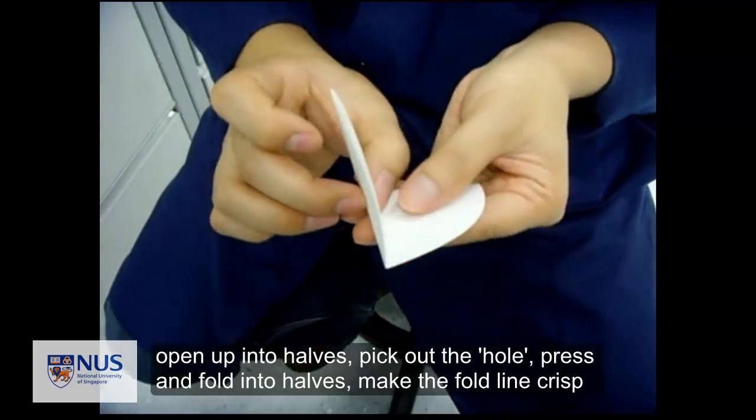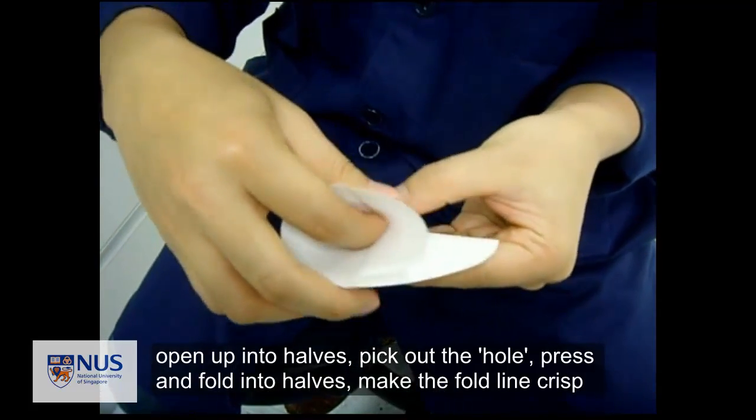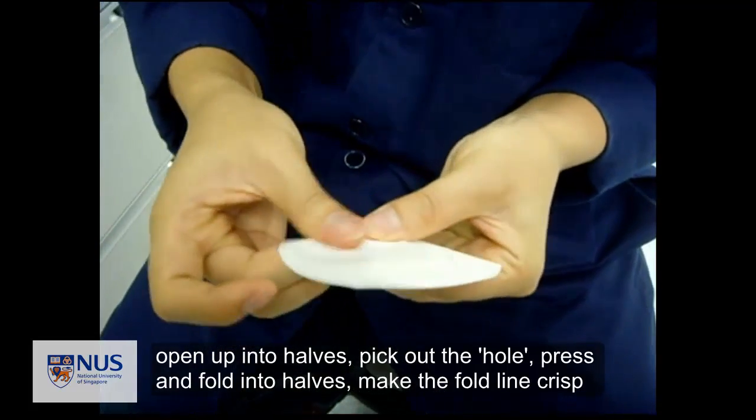Now you open up one of the sides, open the gap, push it down, divide it into half, and make it crisp.